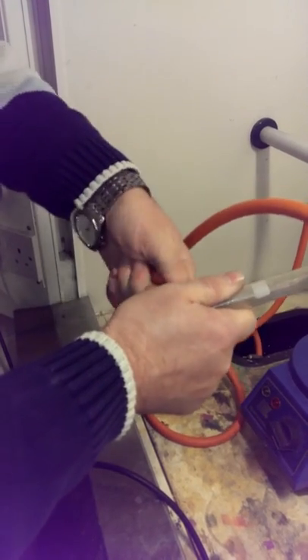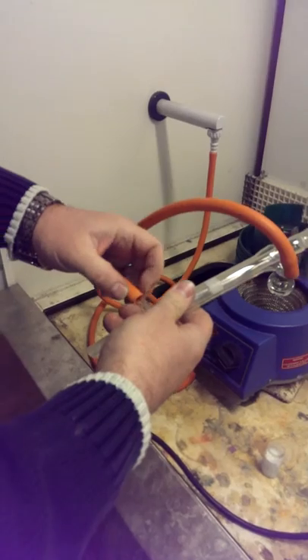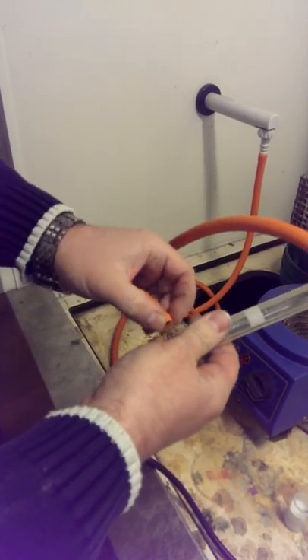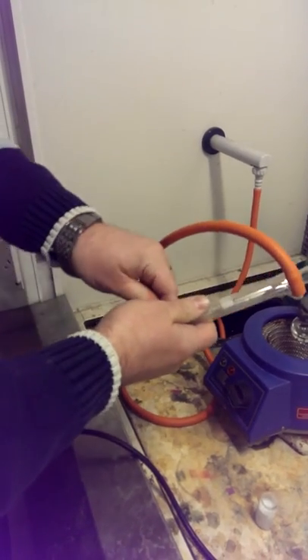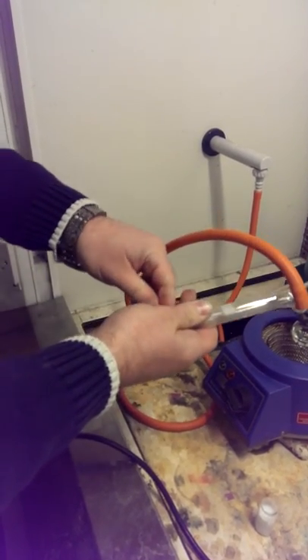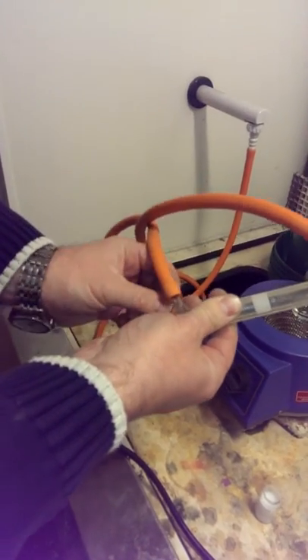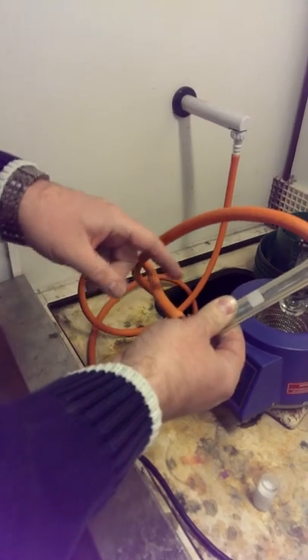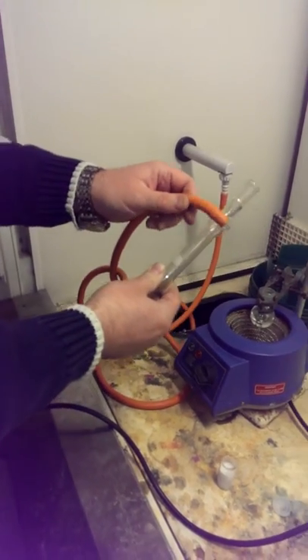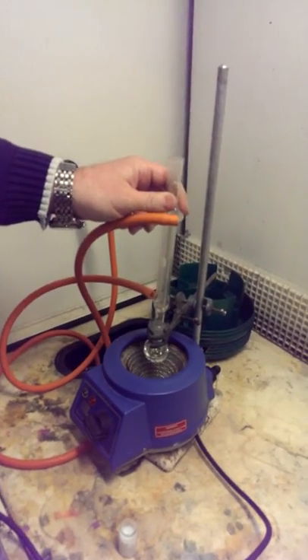Should you be doing anything where you reflux overnight, it's best at that point to put some wire around the edge of the tubing to securely fasten it in place. So if you were refluxing for the evening or for one to two days, make sure you get some wire and really tighten it around the edge of the condenser to make sure it doesn't wobble off or squirt off with a high jet of water.